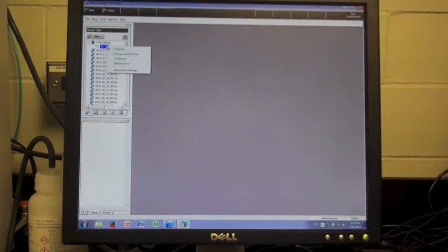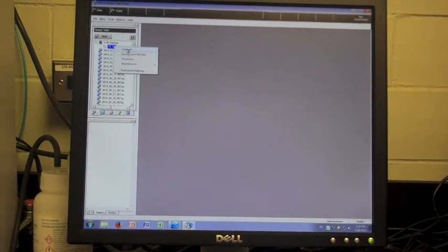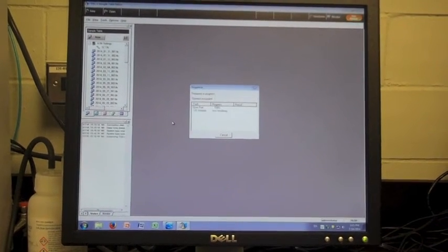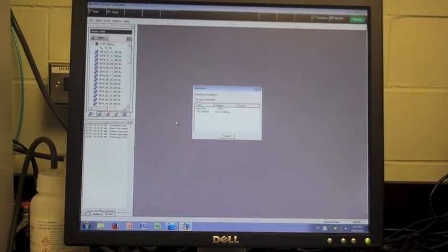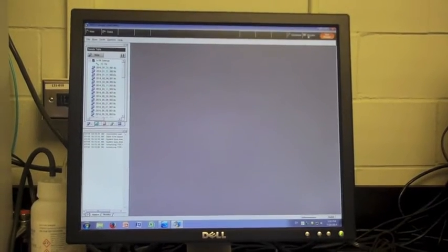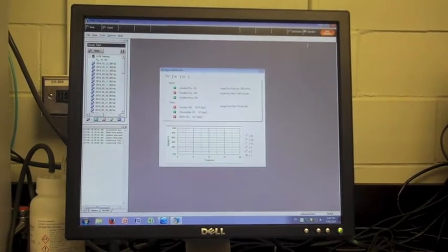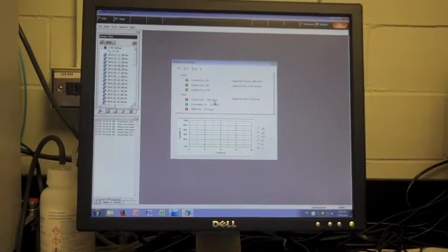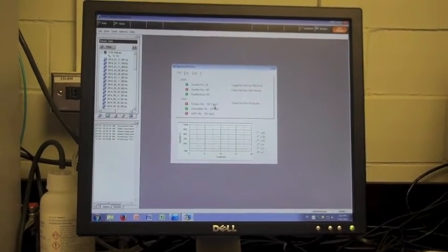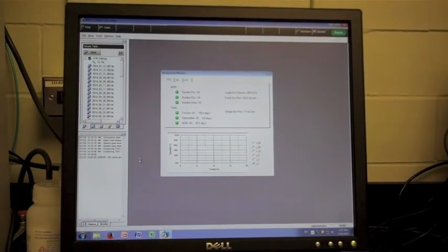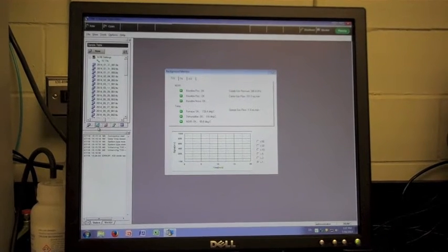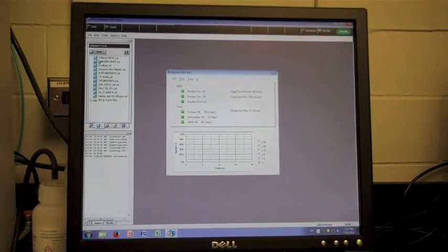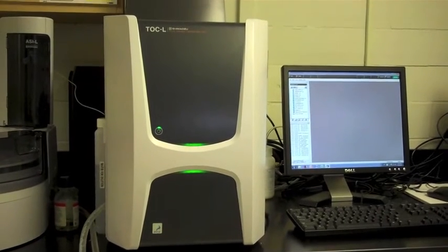Once you have completed this, select the HW settings again and select Connect. This will connect the machine and the computer. After this, select the monitor option in the top right corner of the window, which shows the status of various portions of the machine. Once the furnace has reached the appropriate temperature, all of these functions should reach OK, meaning the machine is ready. In addition, the machine itself will turn green.